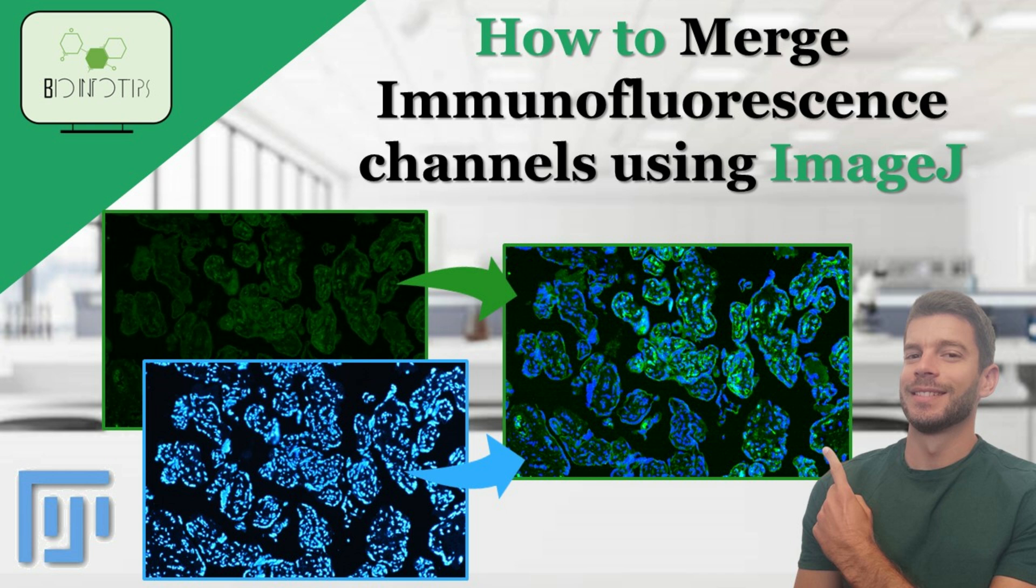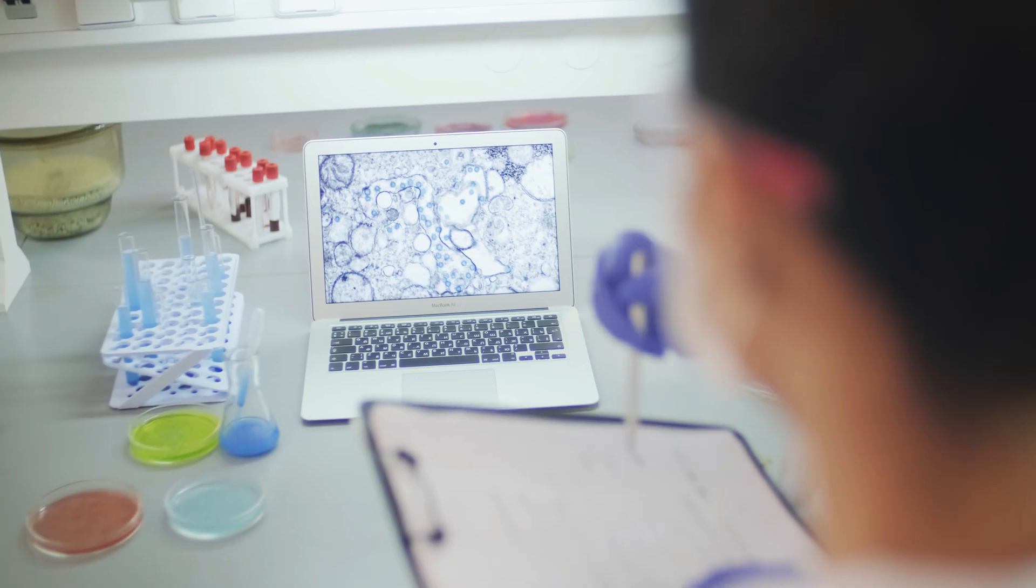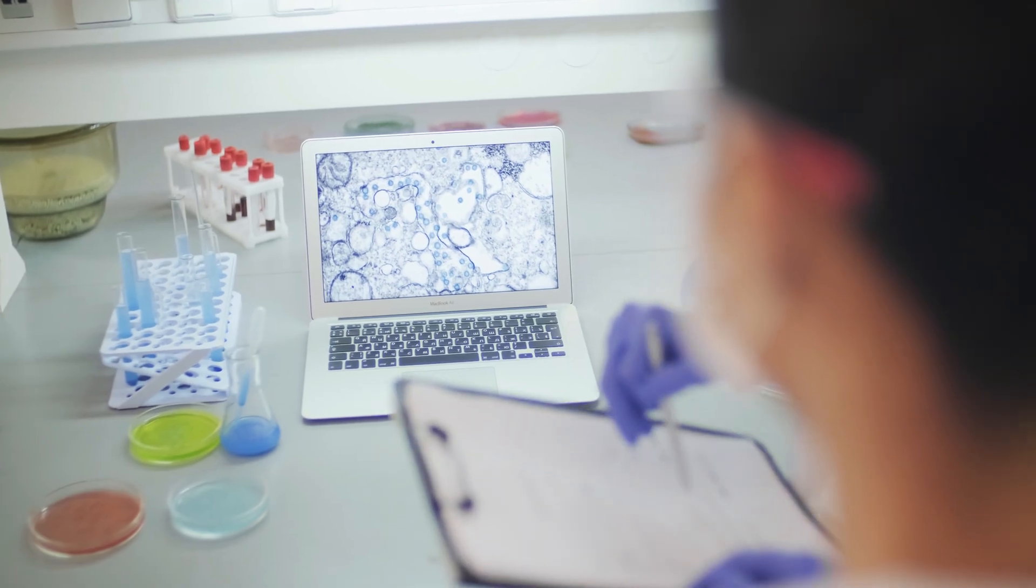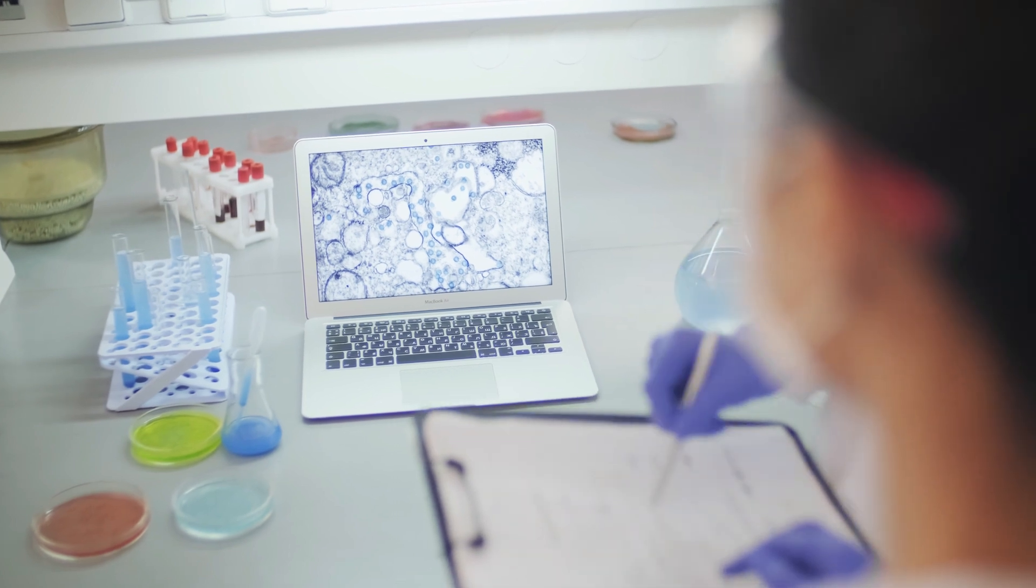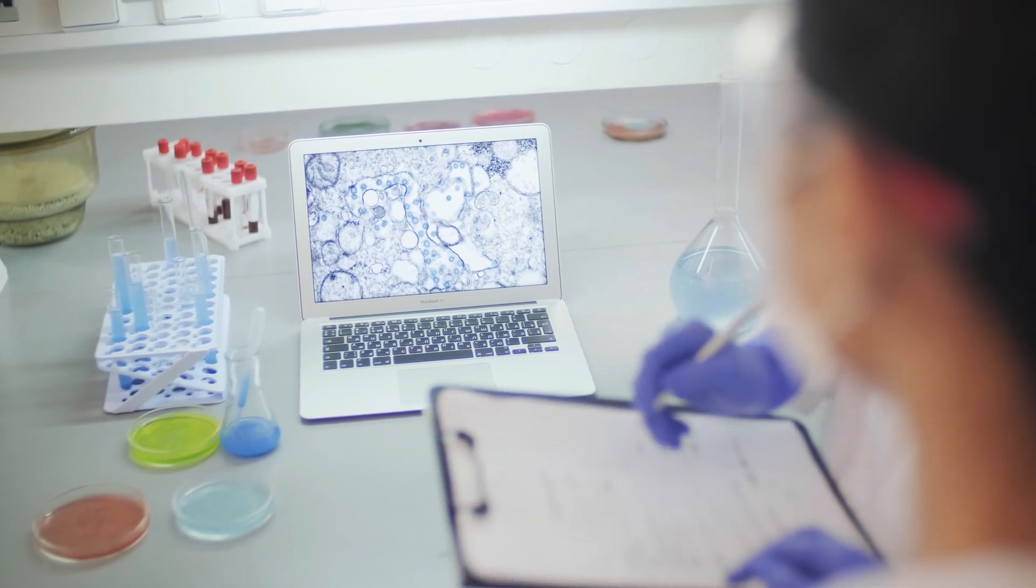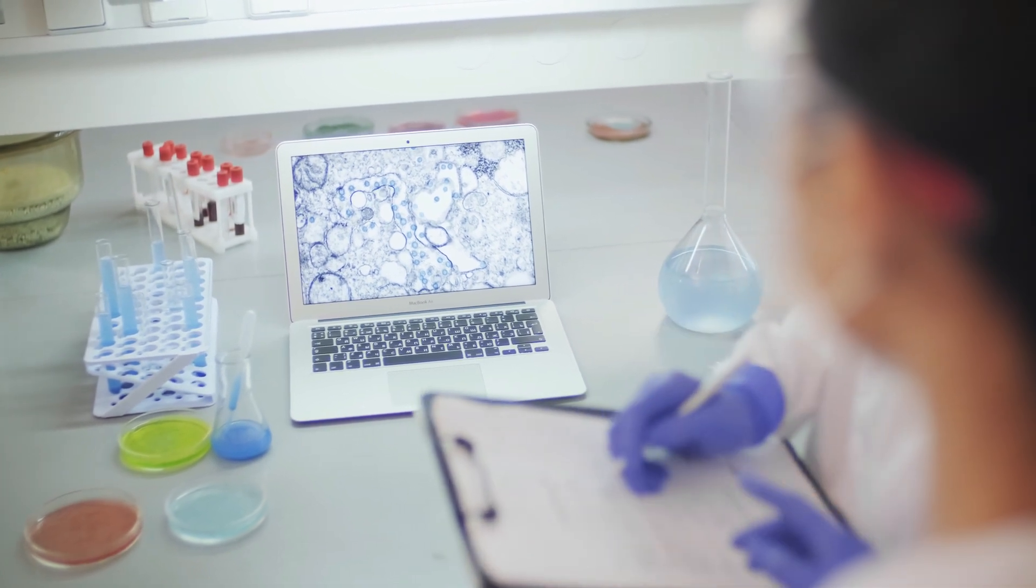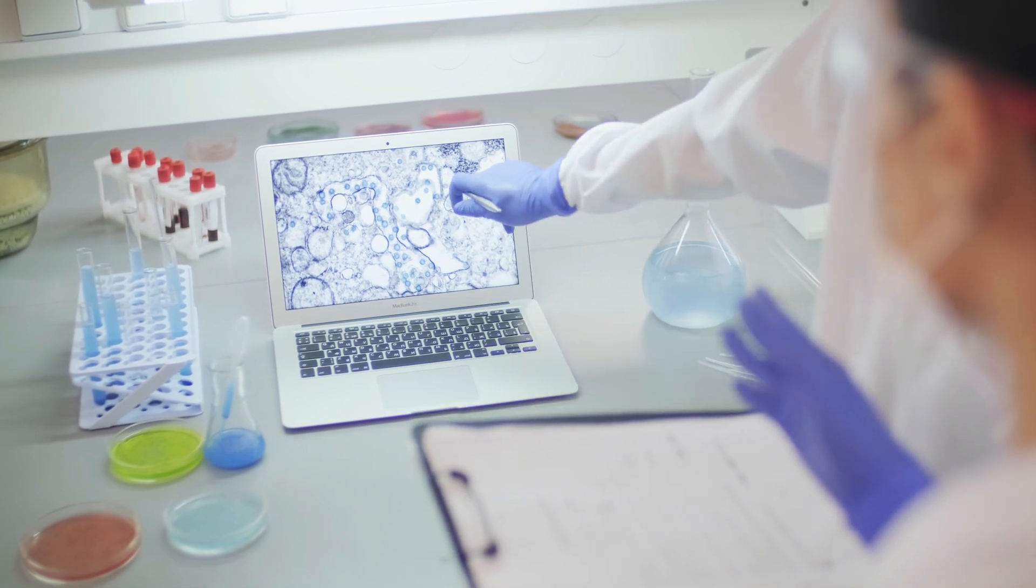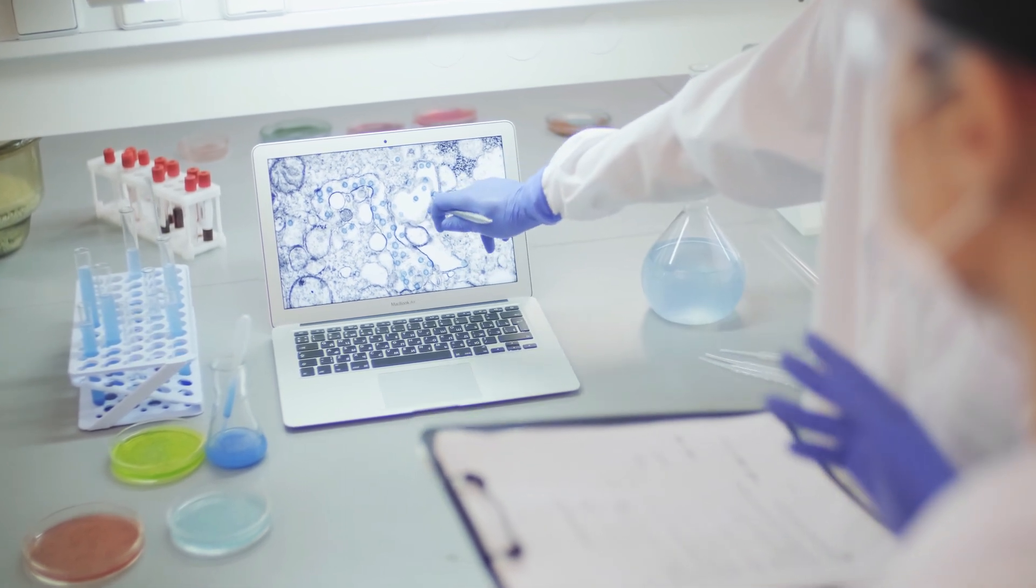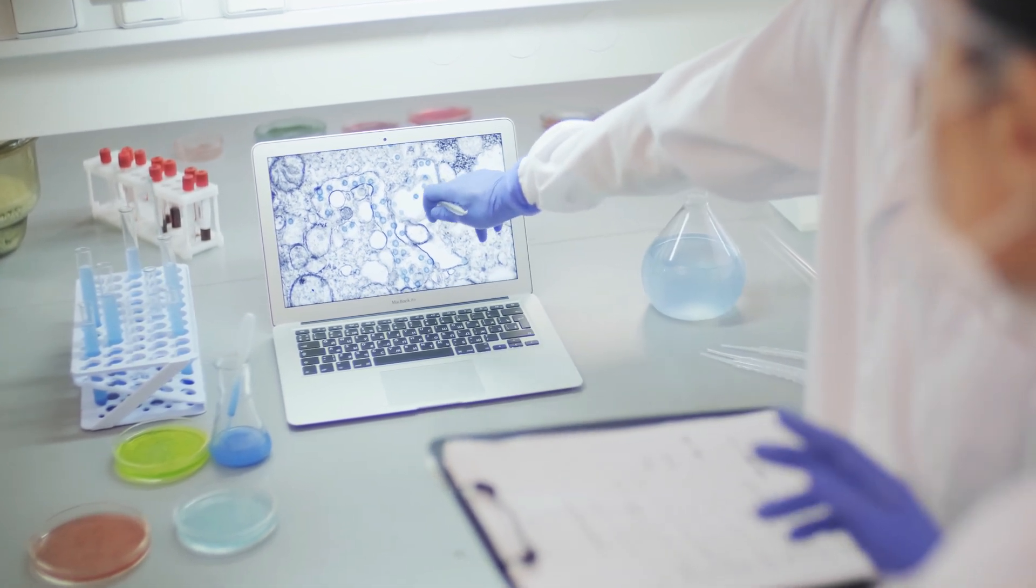Today, we're going to learn how to merge immunofluorescence images using ImageJ. This technique is essential for visualizing multiple fluorescent signals in a single image.